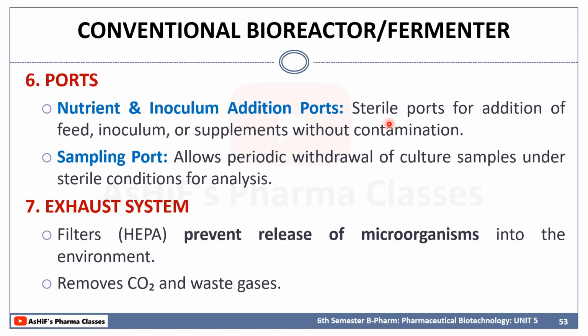We don't have to open a large area of the fermenter; we just open these ports and add the respective thing. And we have a sampling port through which we periodically withdraw culture samples and check for sterility and other conditions. So these are the ports.